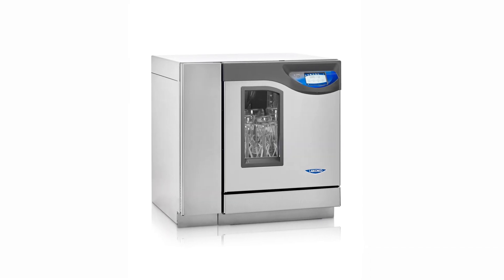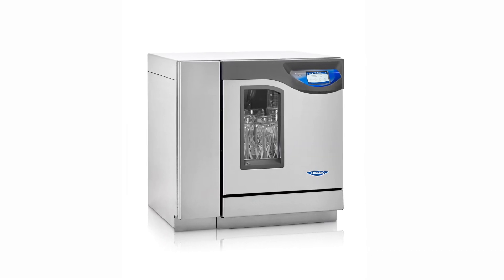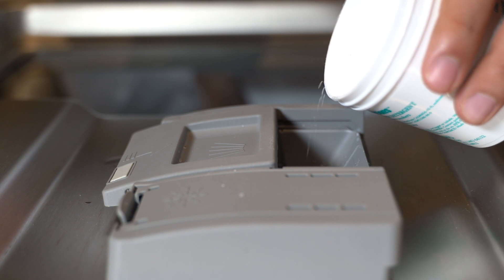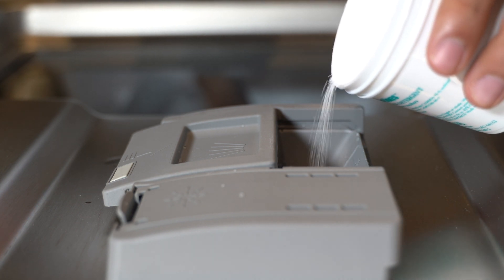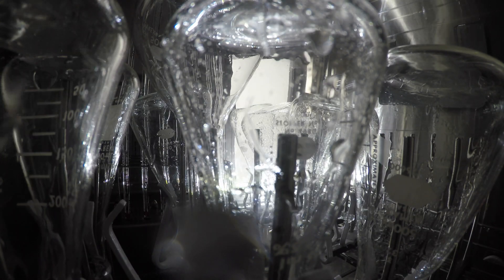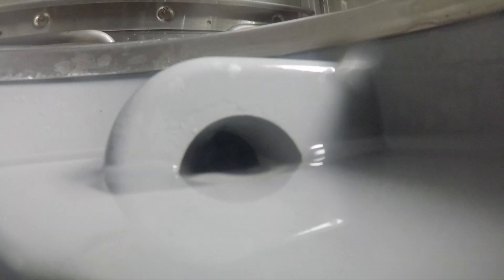Our Flask Scrubber Vantage model is designed for contaminant-sensitive applications. It's equipped with CleanPoint technology, which uses a water conductivity sensor that allows you to monitor the purity level of the rinse water, ensuring the level of cleanliness your procedures require and avoiding unnecessary pure water rinses.